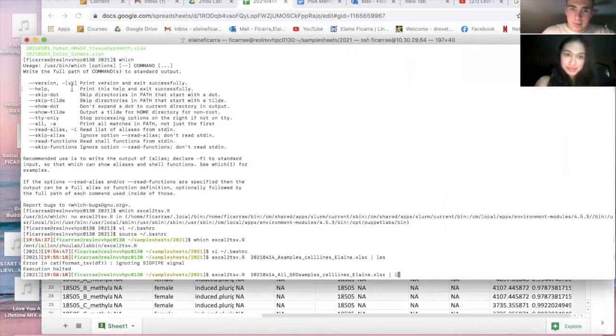Let's figure out, it's going to be annoying if we have to keep reloading it. So what we're going to do is we're going to just make a temp. Let's just do this.